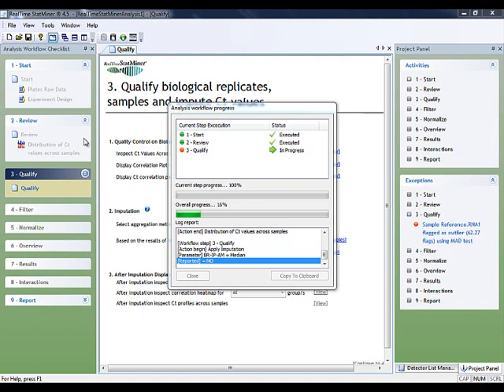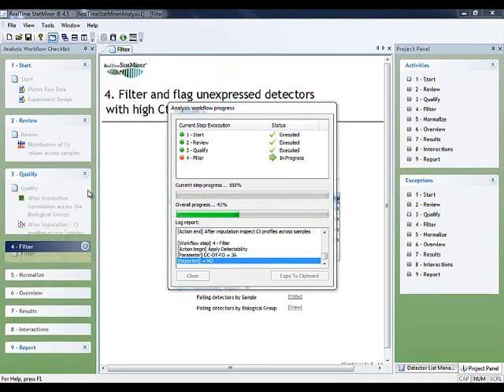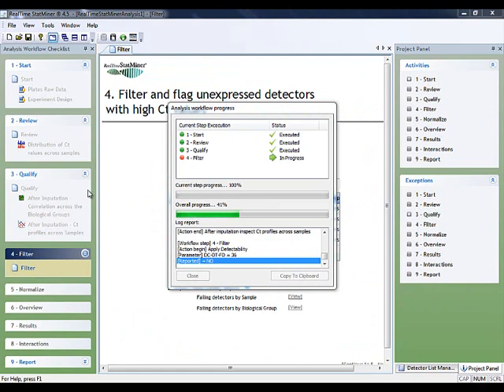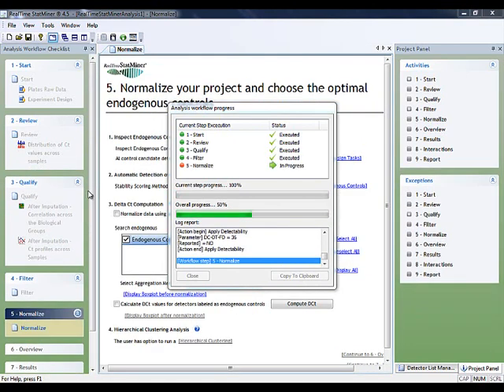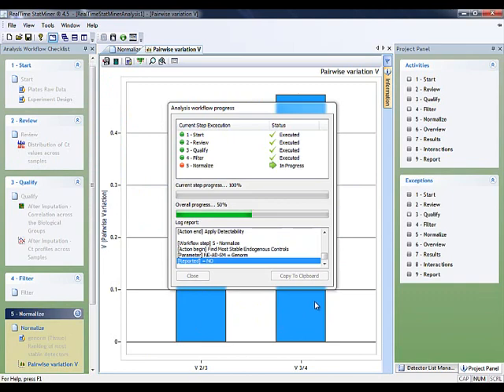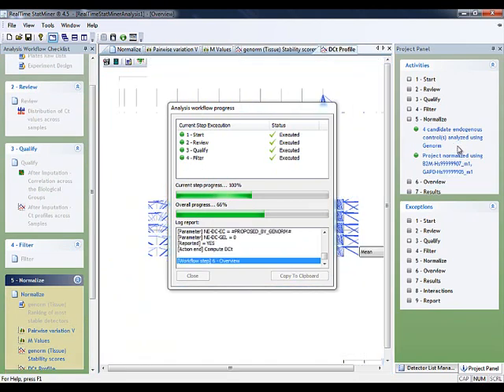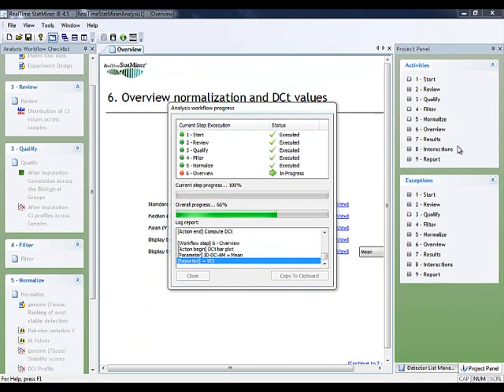Once Click and Go analysis is finished, we can go and inspect one by one every intermediate result thanks to the Workflow Checklist panel on the left side. As we can see, this panel is being populated with intermediate results of the analysis that we can inspect later. For example, technical outlier distribution, sample correlation, DCT normalizing, etc. The panel on the right-hand side provides a step-by-step summary of the settings applied to the analysis and warnings that could arise after applying the quality controls over data.